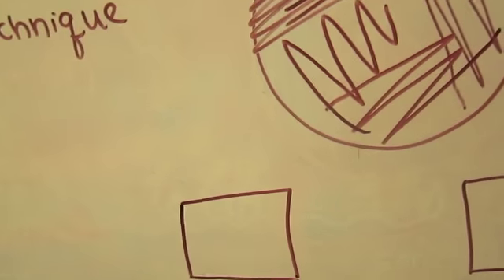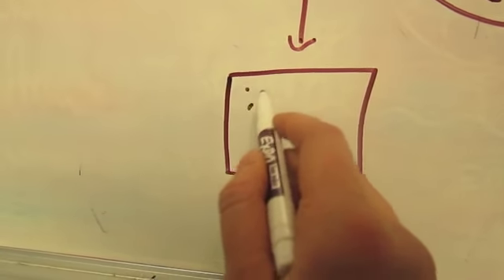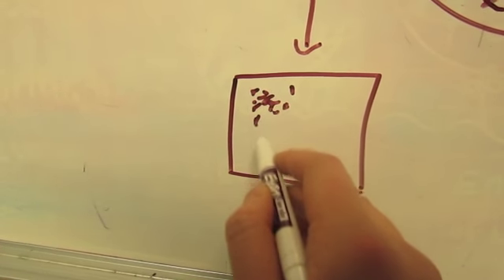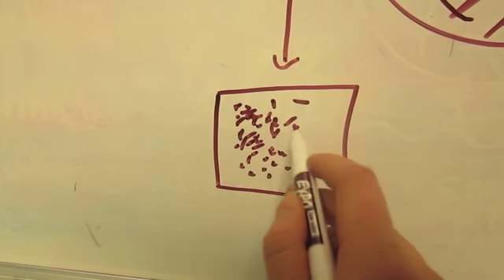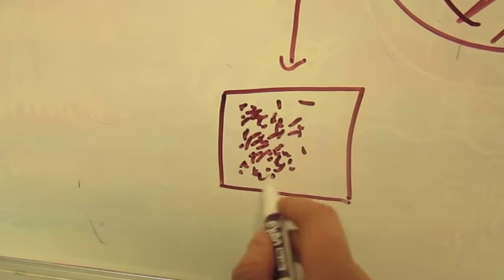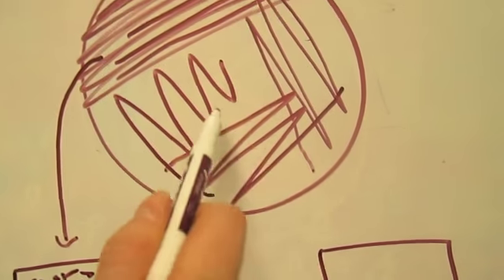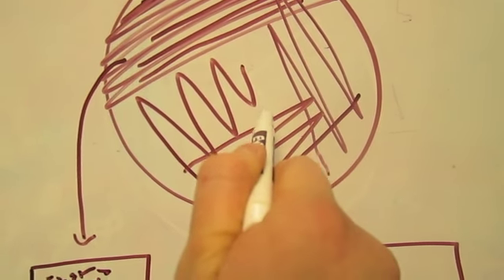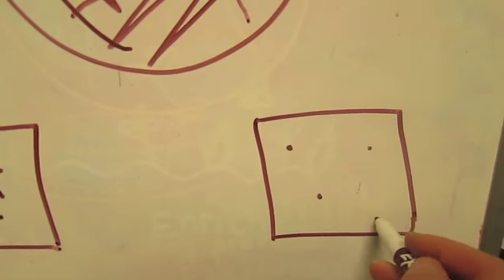Microscopically, what you're going to find, if we look under the microscope figuratively, is that in this quadrant the bacteria are all clustered. They're overlapping each other, and when you incubate it and they grow, you're not going to be able to find colonies because they're unhappy, they're overcrowded. Then in this quadrant, where the bacteria are spread very thinly, you're going to find the bacteria are spread apart.